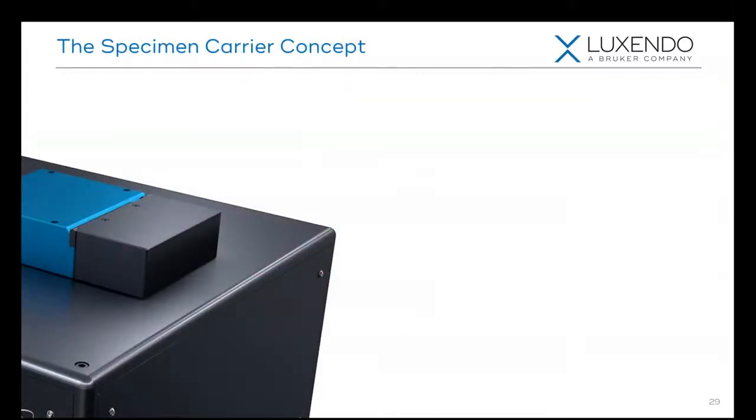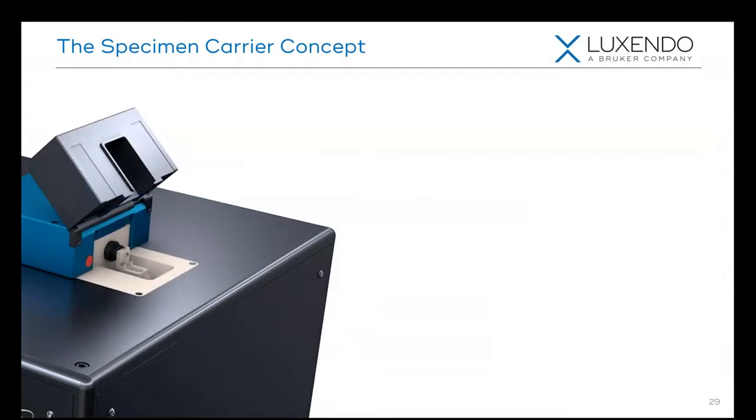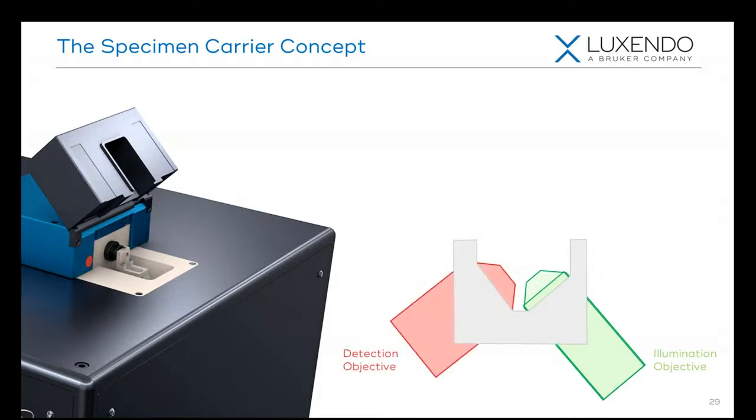The specimen carrier is really the crux of the InVi, and this is what makes this thing work. So here's a side view of our illumination chamber, or of our incubation chamber. We see that we have a single illumination objective, our single 25x 1.1 NA detection objective, and both of these objectives are water immersion objectives. And we use water immersion objectives for their optimal properties of long working distance and high numerical aperture.